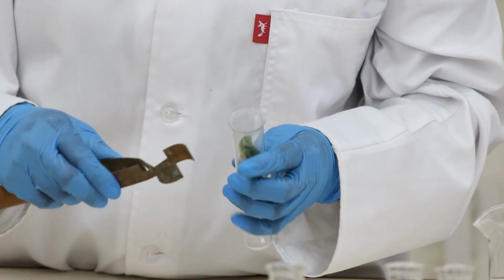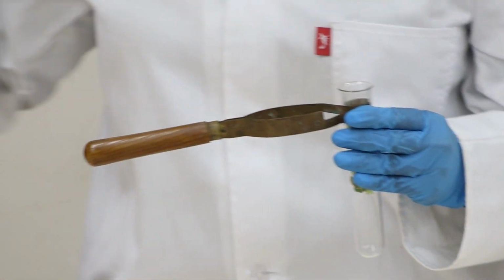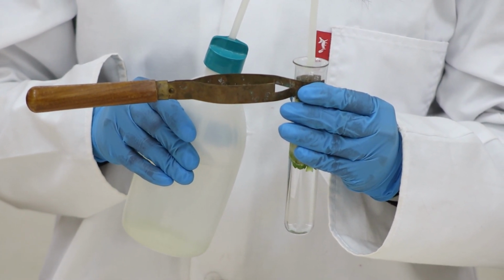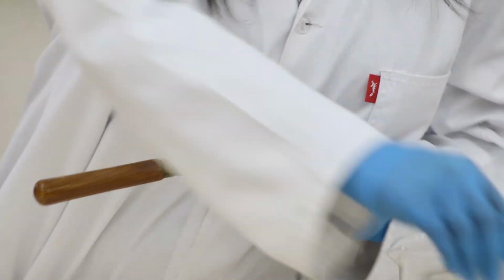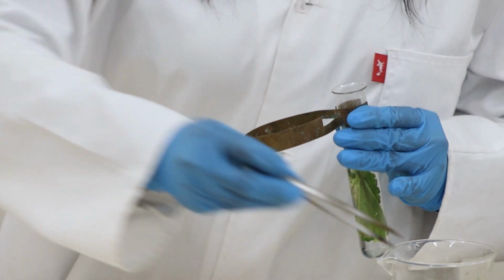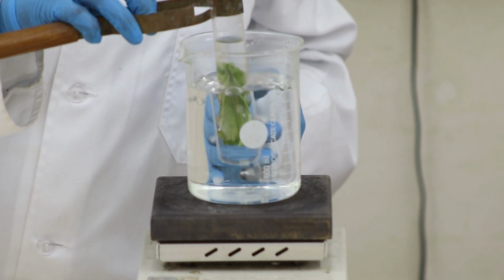And then we fill this tube with water. The reason that we are boiling the leaf in water is to break down the cuticle and the cell walls, and we will use forceps to make sure that the leaf is immersed in the water, and then we will boil this leaf in water for 3 minutes.